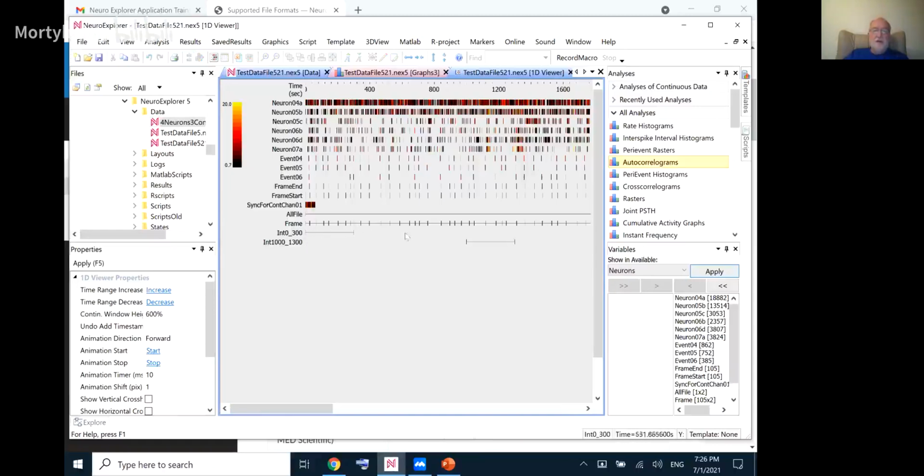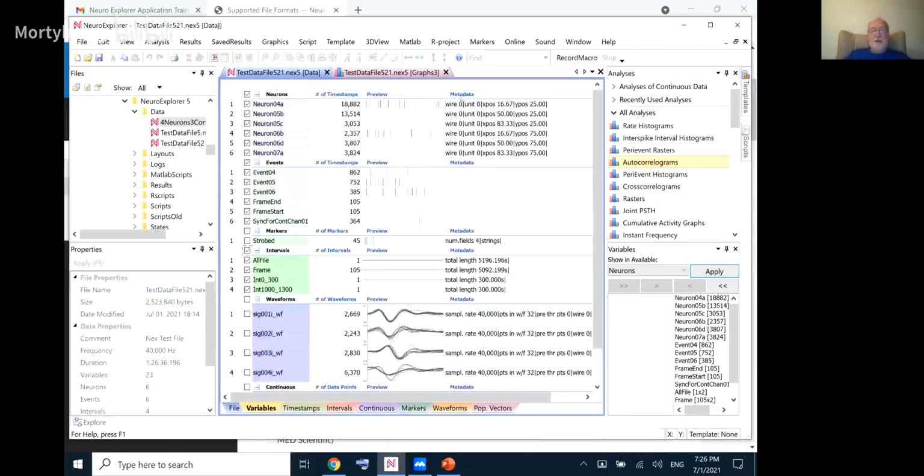You can actually have multiple intervals. For example, if you have behavioral experiments and you have some events like stimulus, or you work with trials, you stimulate, you want to look at something right after the stimulus. So we'll have multiple intervals. Each interval will start with a stimulus and last, for example, 2 seconds.